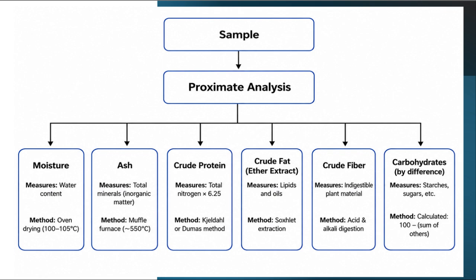Fourth, crude fat, or ether extract. This measures the lipids and oils using a Soxhlet extractor. The sample is continuously washed with a solvent like petroleum ether, which dissolves the fat. The solvent is then evaporated, and the fat is weighed.